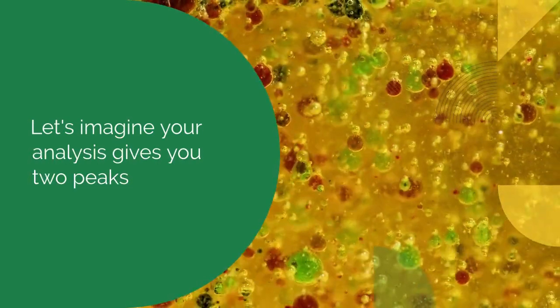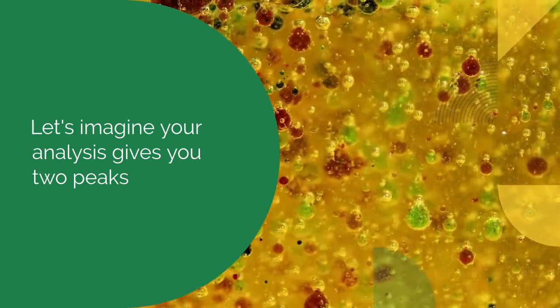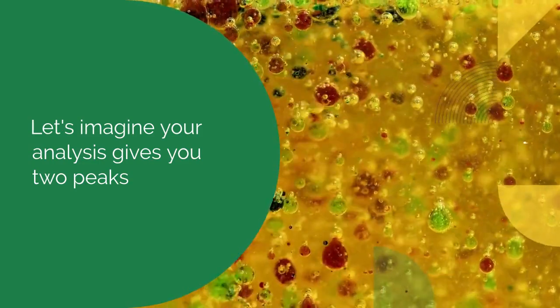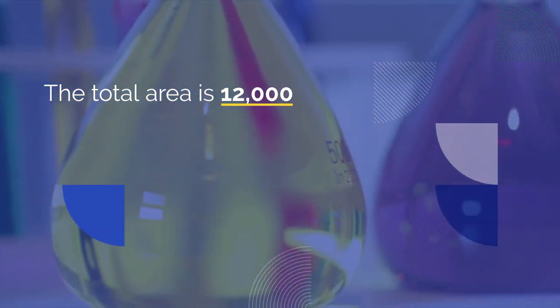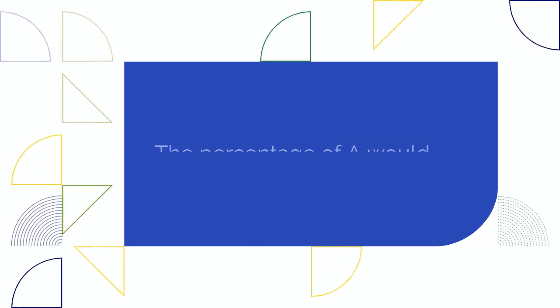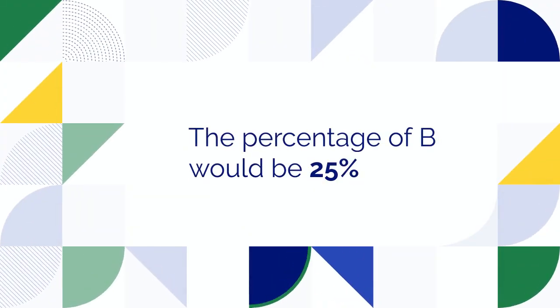Let's imagine your analysis gives you two peaks. Peak A has an area of 9,000 units, and peak B has an area of 3,000 units. The total area is 9,000 plus 3,000, which equals 12,000. The percentage of A would be 9,000 divided by 12,000 times 100, which gives us 75%. The percentage of B would be 3,000 divided by 12,000 times 100, which is 25%.